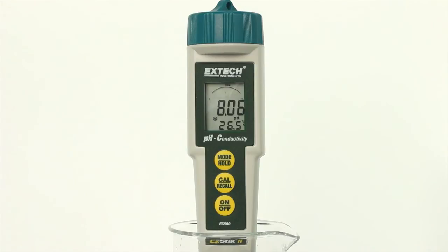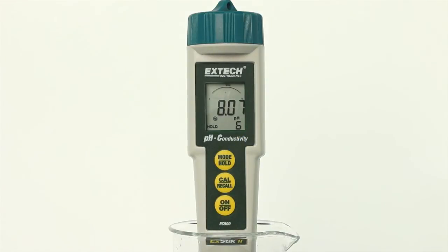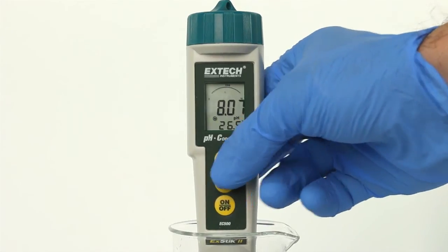Press the MODE/HOLD button to hold a reading in the display. The hold indicator will appear. This also stores the reading. Press the MODE/HOLD button again to return to normal operation.